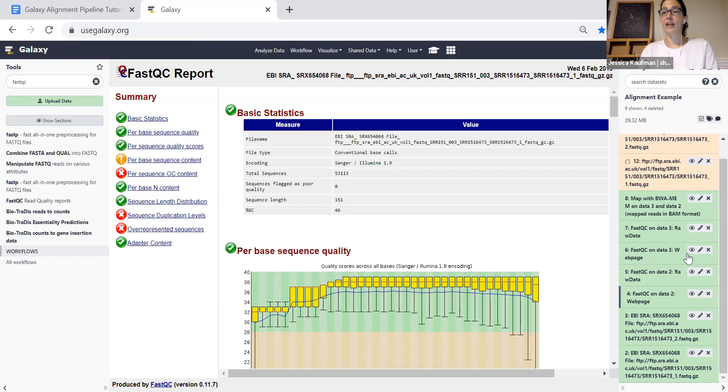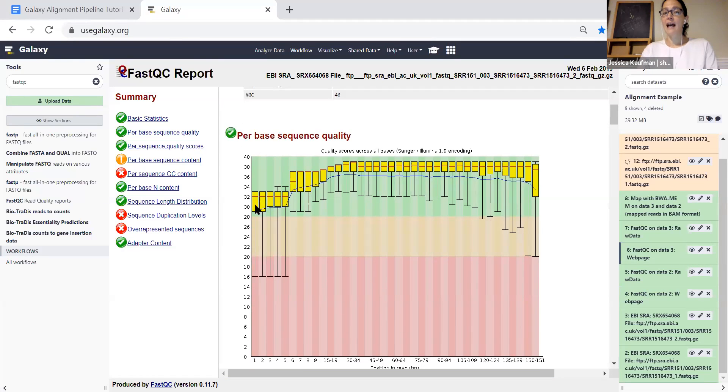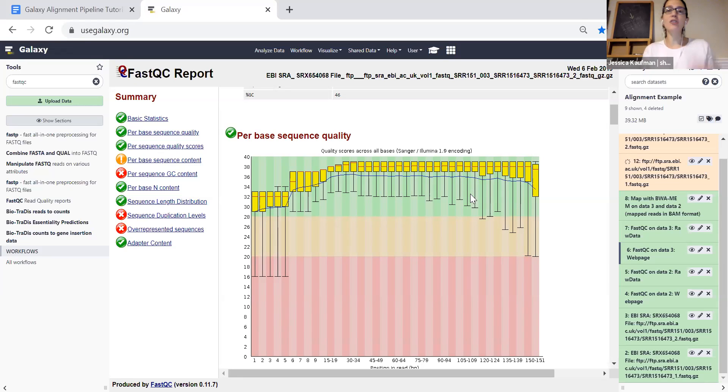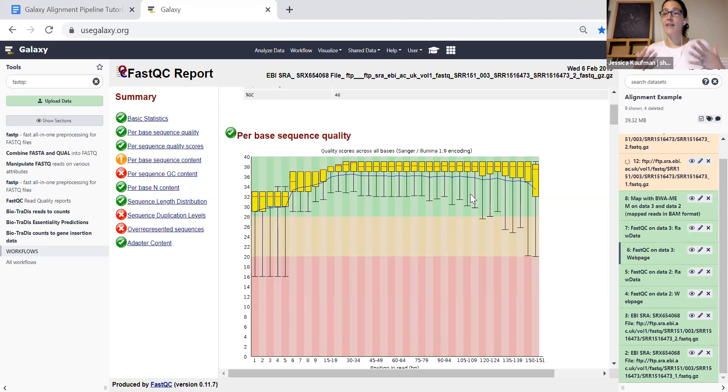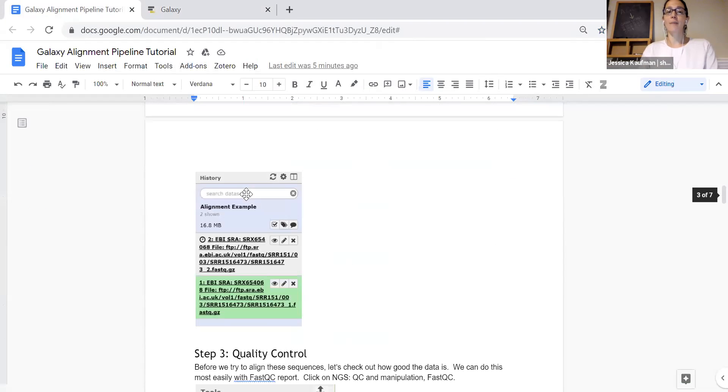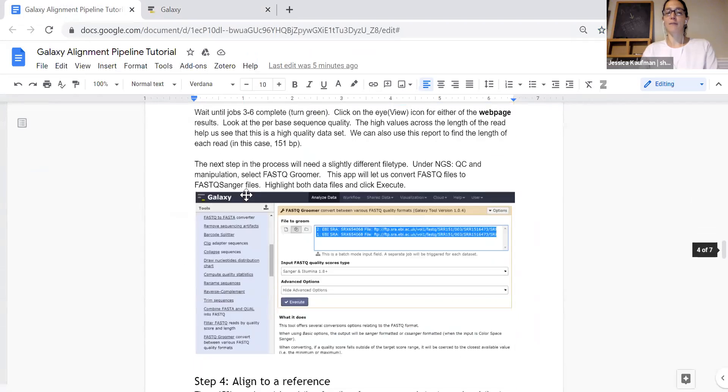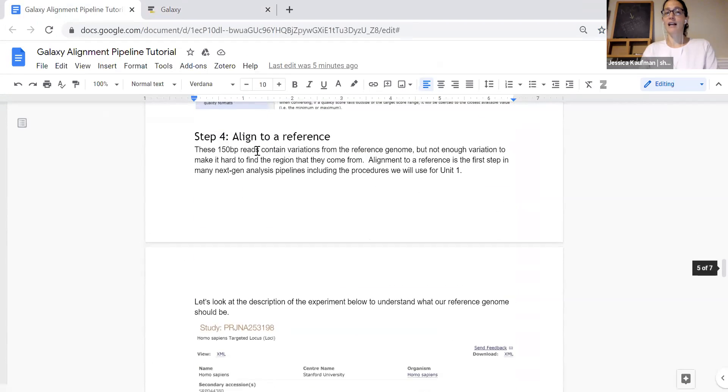Once you've verified that both the forward and the reverse read have error bars and a box plot that's in this green range, we know that the base quality is high enough to do the alignment and we're ready for step three or step four, aligned to reference.